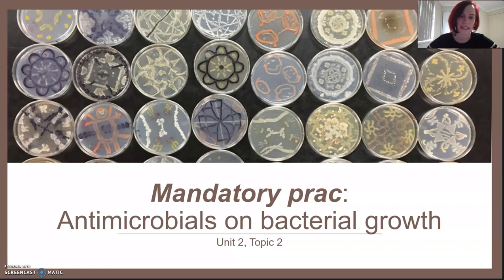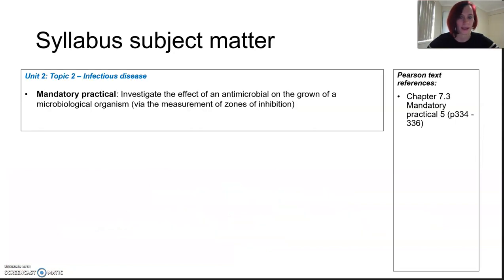In this lesson, we're talking specifically about our mandatory prac, growing bacteria and using antimicrobials on them. Okay, here's our one dot point. It is just the mandatory prac.